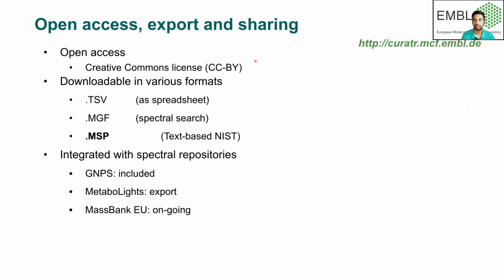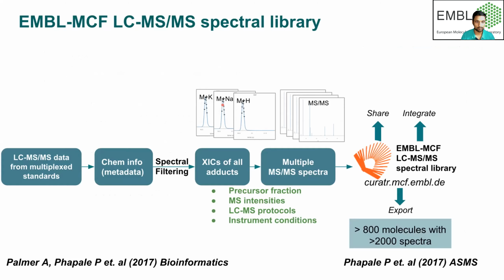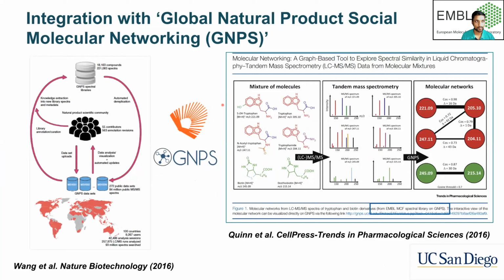I'm not suggesting you use only this library, but that you pool the different libraries which are publicly available, such as MoNA, which is a very good resource. Our library is also available on MoNA, and you can download it from there as well. Combine them, make your own customized library, generate some data to validate that library, and then use it for metabolite analysis. This is the overview of our library, and you're welcome to use it.